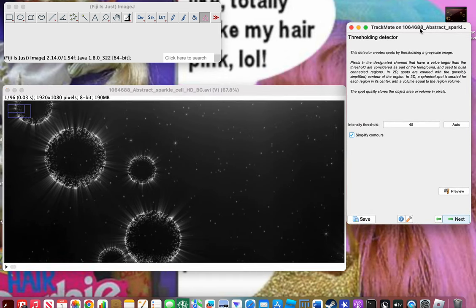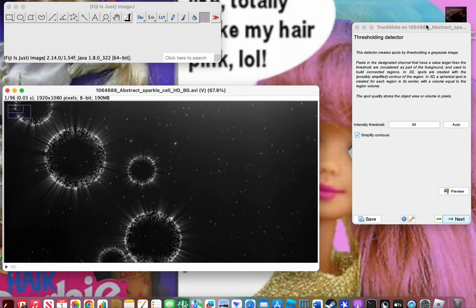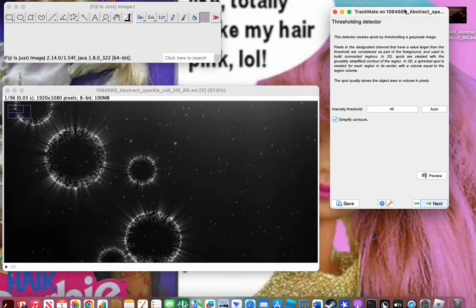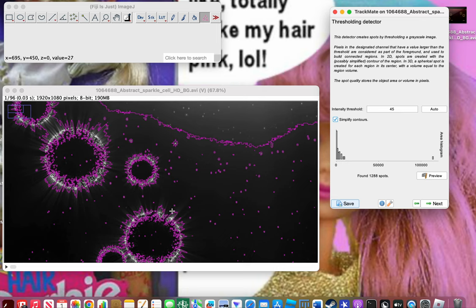This next step is to make sure it's going to be tracking everything correctly. If you see something wrong here, this is the first sign it's not tracking right. Make sure 'Simplify Contours' is on so you don't get something ridiculously messy. Press Preview. When I first downloaded this, I thought TrackMate would be tracking the direct cells, but it's actually tracking each and every distinct little bright dot.